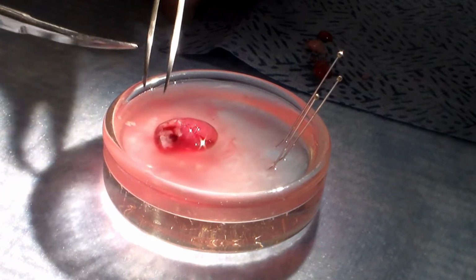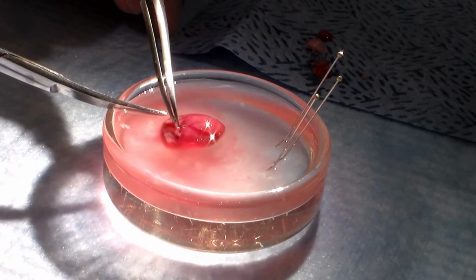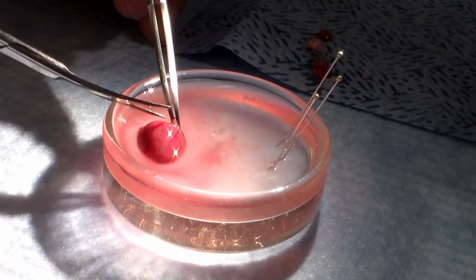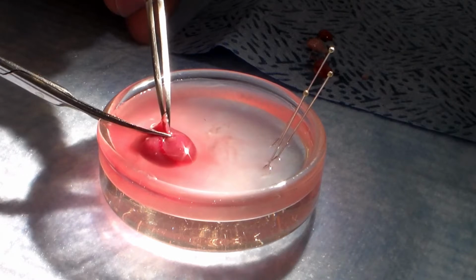The right ventricle can be identified by its thin wall. Its opening at the base is crescent-shaped. The opening of the left ventricle is circular and surrounded by thick muscular walls. The technician now holds the thin wall of the right ventricle and trims it away from the septum.